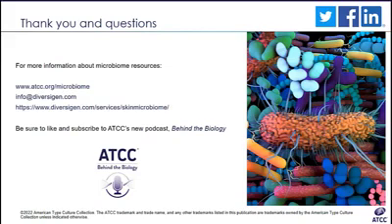In terms of the environmental samples, I'm not sure if you're referring to including a sample like that in the actual pipeline, but I think any control that you can add that will help you analyze your data at the end of the day is going to be very important. I usually don't suggest removing the sequences from your blanks. I know with 16S data, you can do that very easily with QIIME, for example. With shotgun data, it's a little bit more complicated. But my recommendation is not to do it if you really don't have to. Okay, good.